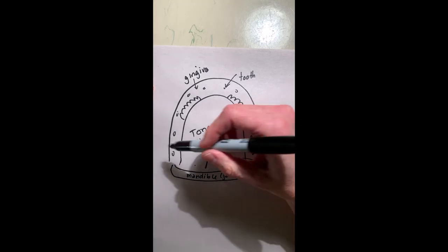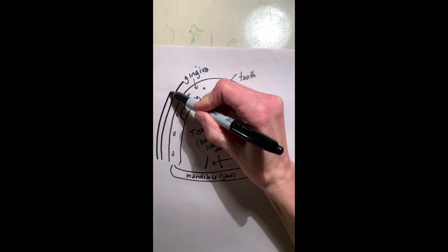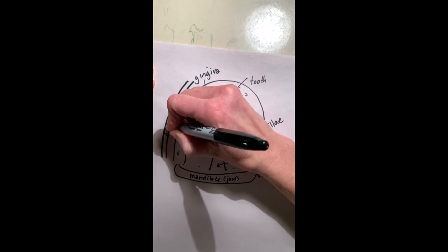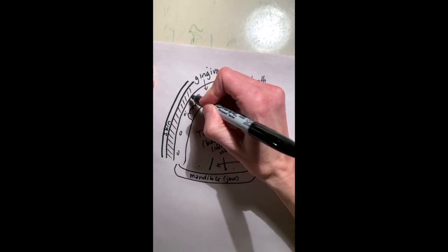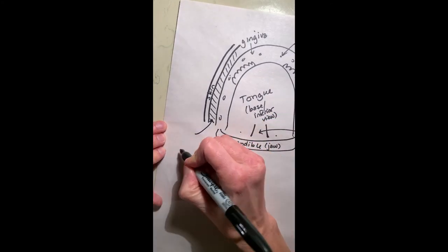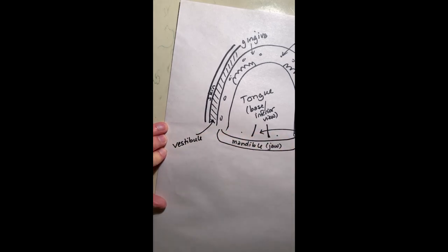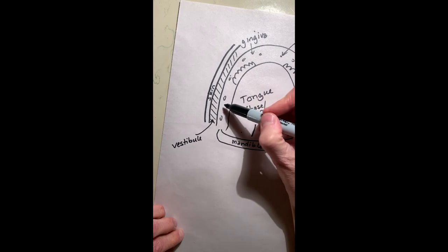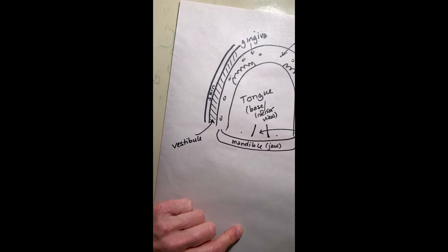There's a space between the skin that makes up the cheek. So this is the skin. There's a space here. It's a great place to stash gum, right? So this space is called a vestibule. The vestibule is a potential space that can be made wider if you stick something between the skin and the gums, between the bone. The vestibule is a space that goes all the way around.